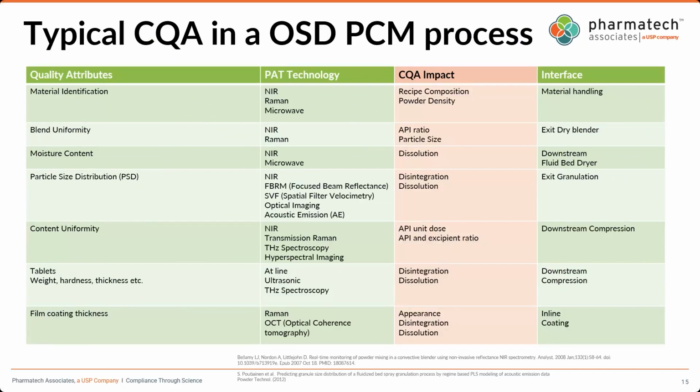that technology evolution. I mentioned already the reliability of this technology is rather critical, in particular when it comes to continuous manufacturing, because you have quite some investment in a continuous process, which you have implemented because of the process capability of this kind of technology. You build on additional complexity with PAT sensors, and if they are not reliable, you basically compromise the original sense of going into continuous manufacturing.